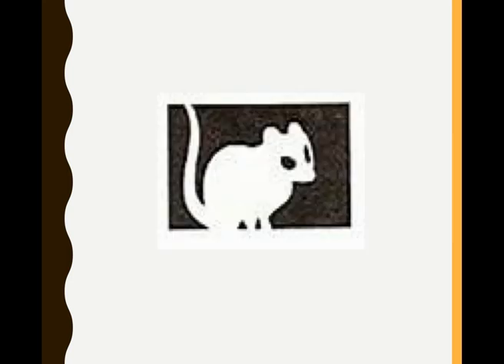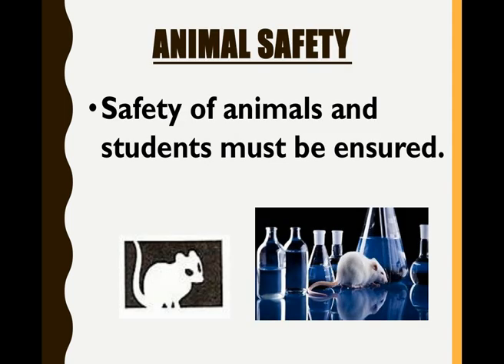And when you see this symbol, what does this symbol make you think? What do you think this symbol means? What it actually means is that we need to ensure animal safety. So you need to make sure that both the safety of an animal and the safety of yourself are ensured when you're working with these.